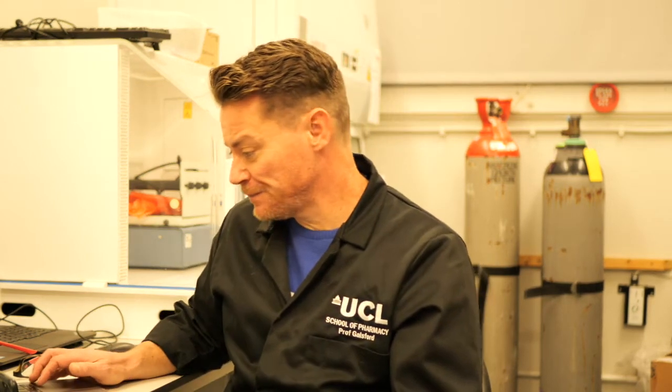Okay? Doesn't matter which type you're using, the magnification limit is the same. It's around about 100,000 times. And the reason is because the magnification isn't about how the microscope is arranged, it's about the wavelength of light, which is electrons in this case.